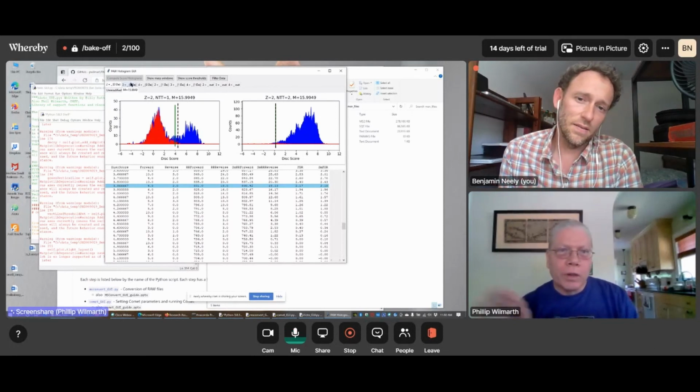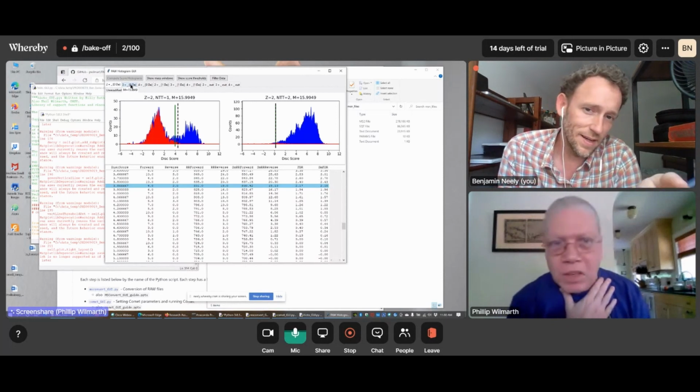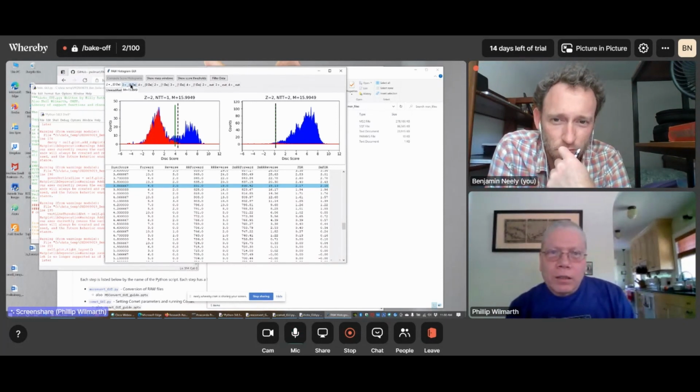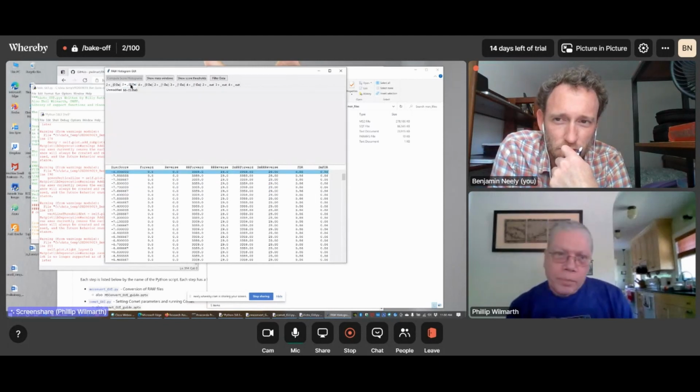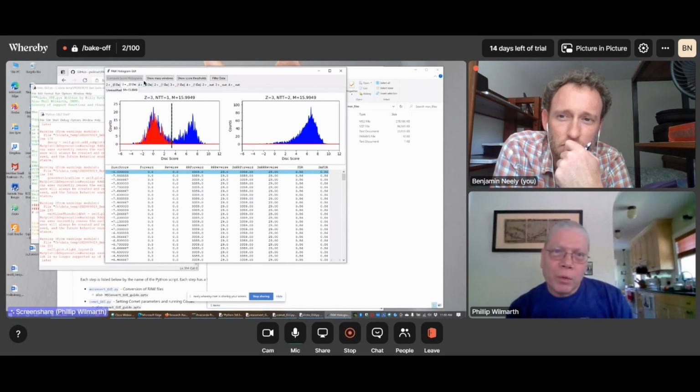But like in this case, that's this 0.65 FDR or whatever. Yeah. So 3+ looks similar, and also oxidized methionine. So most of these are going to be pretty good.